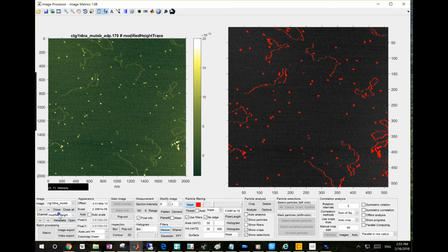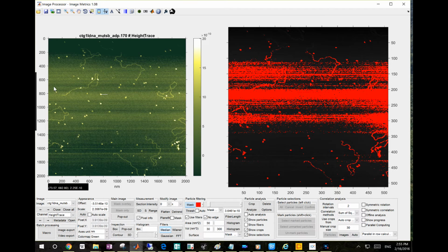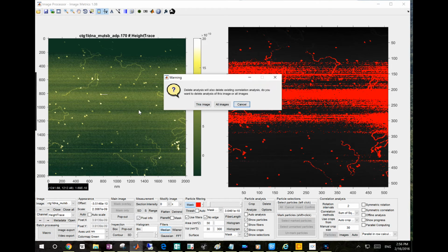The other way to do that, if we have a lot of line artifacts, is this: if there's a specific area, let's say above this area where the mouse circles, that is very volatile and you don't want it at all, you can crop the image and completely exclude the top area. Just right click the image and click resize. Then you can drag a box, saying I only want this area and nothing else. Double click this area, and you can choose whether to crop this one image or all images, assuming they are of the same size.